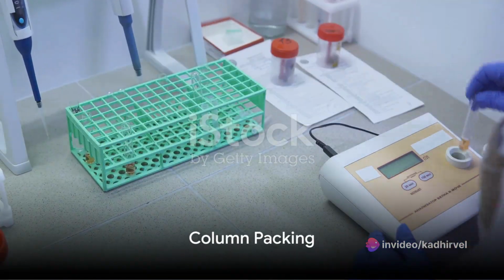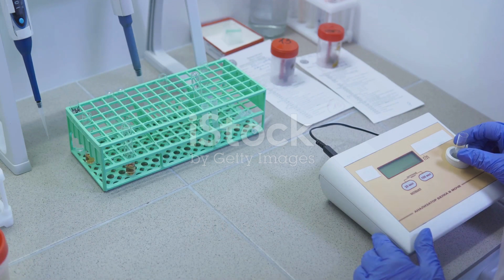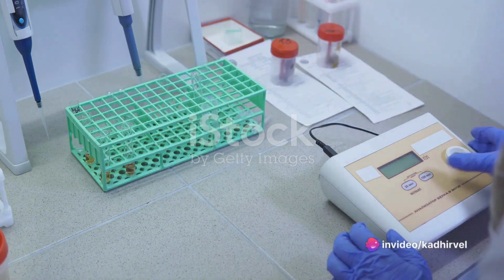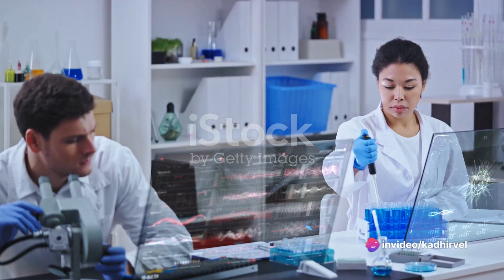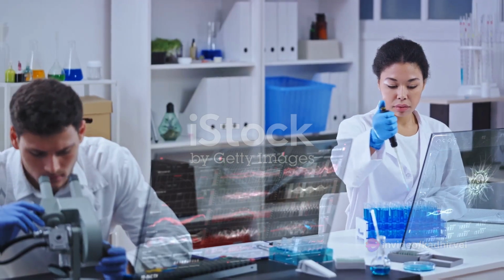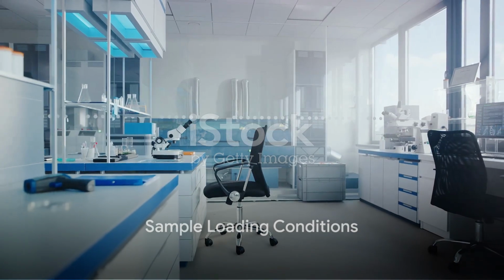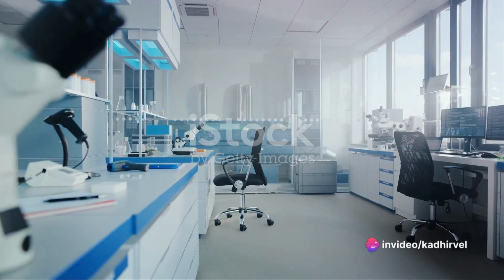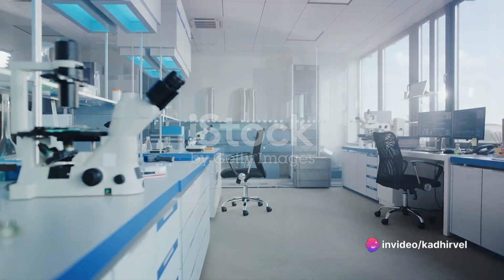Column packing is another critical parameter. It ensures uniform flow distribution and optimal resolution. Any variation in the packing can lead to uneven flow patterns, compromising the efficiency of the separation and reducing column performance. Sample loading conditions, including factors like sample concentration, volume, and loading buffer composition, are also crucial. These need to be controlled precisely to ensure optimal performance.